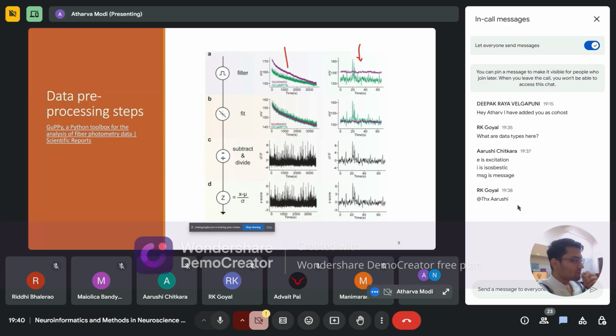So if you keep a fluorescent molecule under light for a long enough time, it will become inactivated after some time. So some proportion of the molecules get inactivated during what we measure. So you get this kind of slope in your signal, and this slope is seen in both the signals basically. Because the number of fluorophores is decreasing, you see a decrease in both the signals.